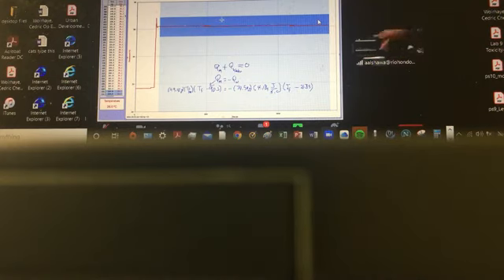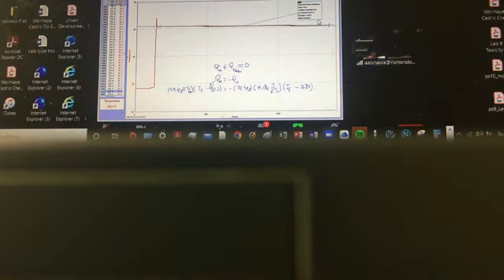I want to create a straight line. Like here's a ruler, and I want to just draw a straight line. That's all my intention. Here's a nice equation for it. Who cares? All I've done basically is create a straight line. From that straight line, I want to go to analyze and just interpolate. So I'm going to bring that cursor to the initial time of mixing.